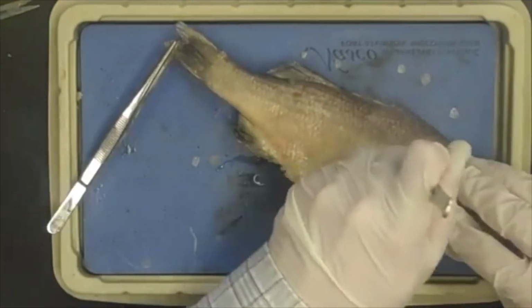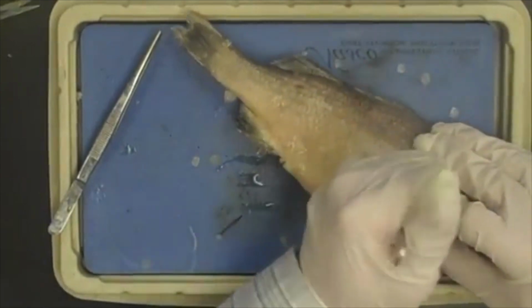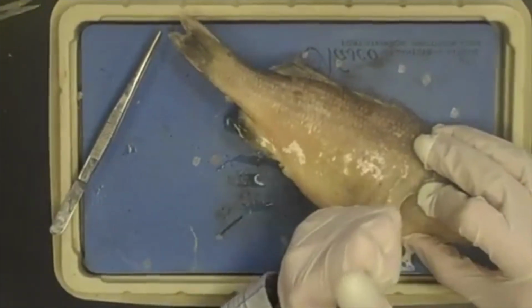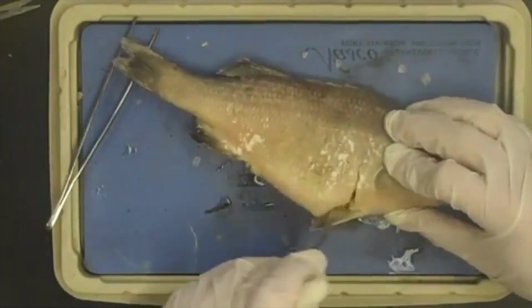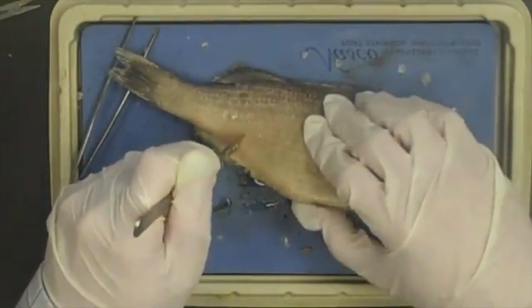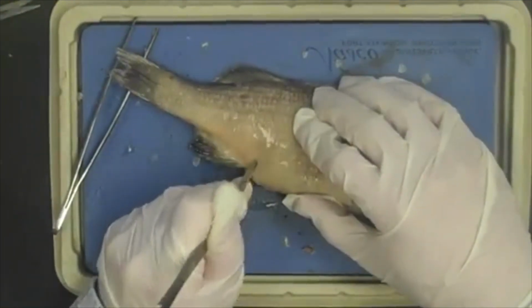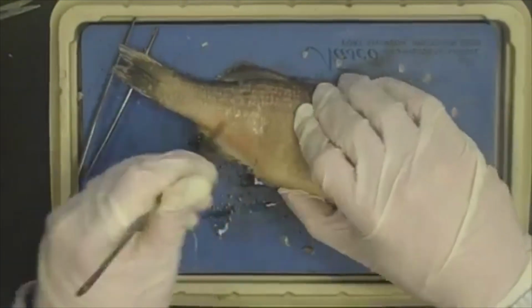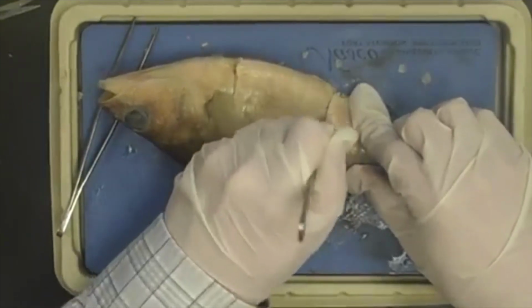Next, you will make 2 vertical cuts from the ventral side of the fish to the dorsal side of the fish, or otherwise bottom to top. One cut should be along the pectoral fin, and the other cut should move vertically from the anal fin up to the dorsal side. When making both cuts, be sure that they're clean cuts, and especially be sure not to cut too deeply. Otherwise, you may damage the internal structures of the fish. Again, if your fish has eggs, clean them as necessary.